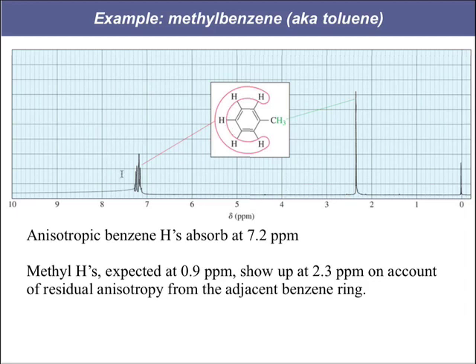So you end up typically with a big jumbled mess when you have aromatic hydrogens like this. So treat that as 1 signal. It's really very complex because there's a lot going on here, but for the most part, that's what you're going to see from hydrogens on a benzene ring.